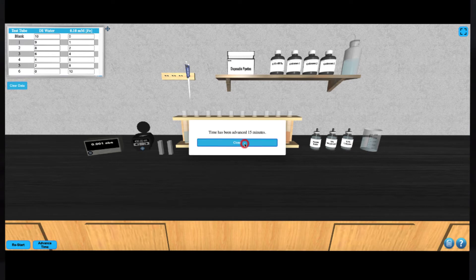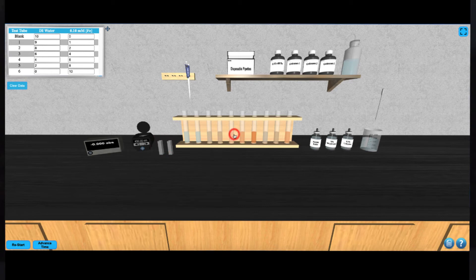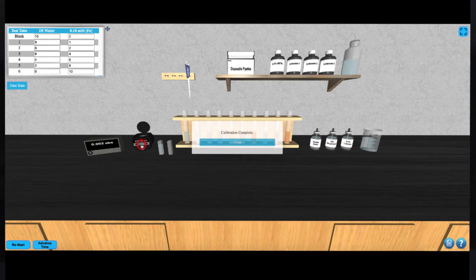At this point, you're ready to start measuring the absorbance. Fill the cuvette with water by clicking on it, and then add it to the colorimeter. Close the lid by clicking on it and hit the CAL button. The instrument will calibrate automatically, and the lid will open, removing the cuvette.